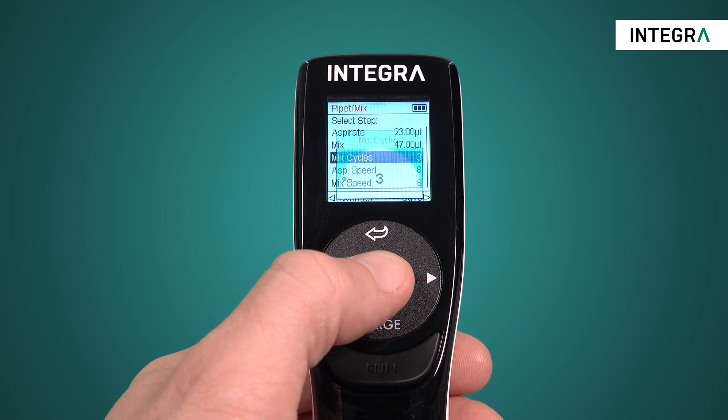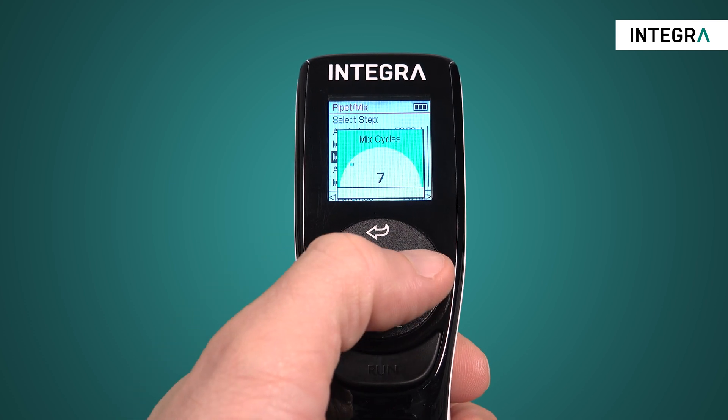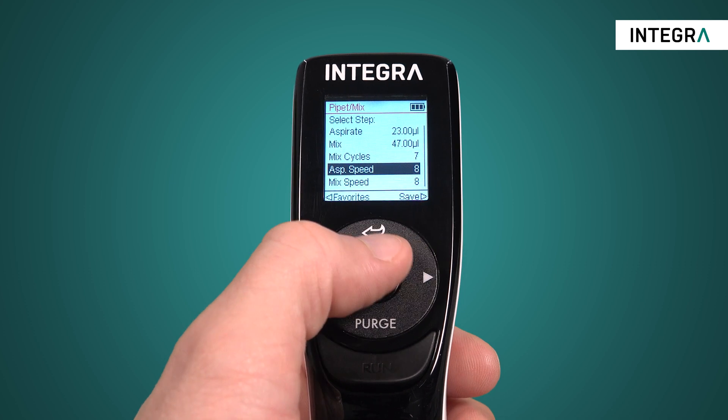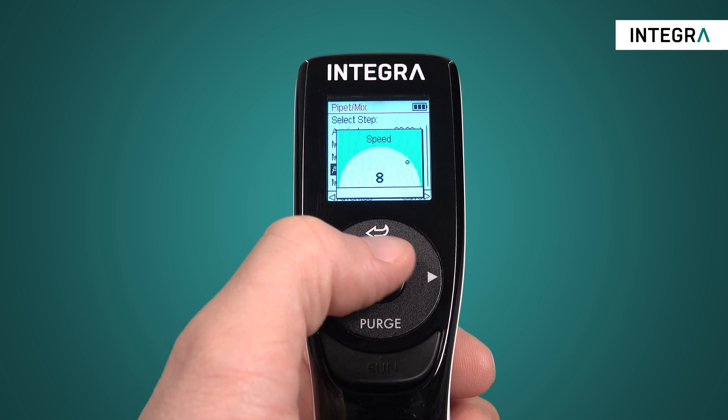Mix cycles indicates how many times the mix will be performed, and the speeds can also be individually set — the speed of the first aspiration and the speed of the up and down motion of the mix itself.